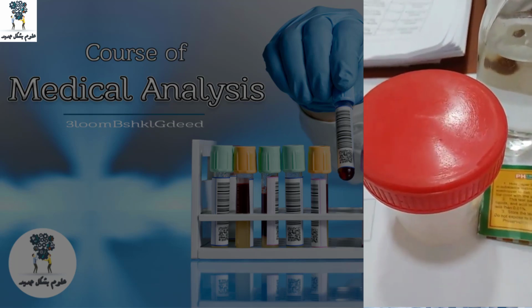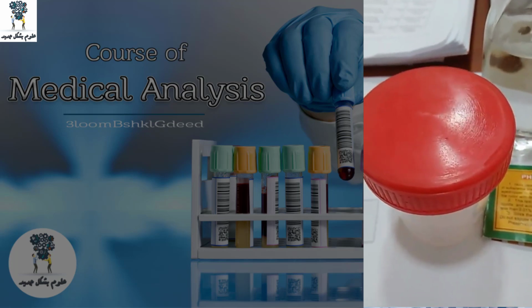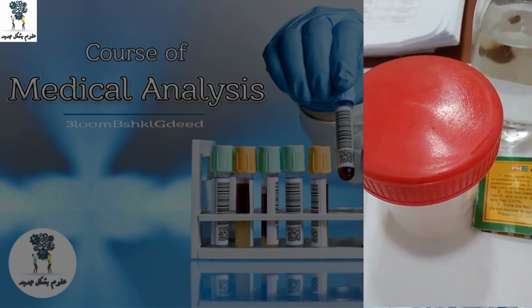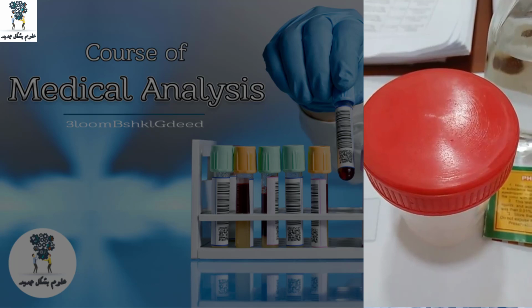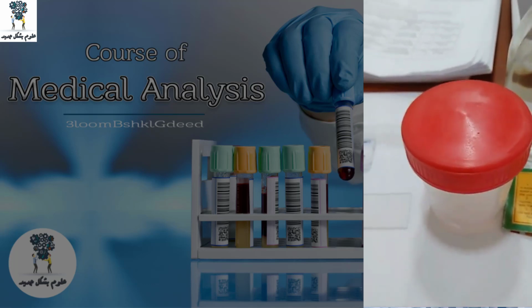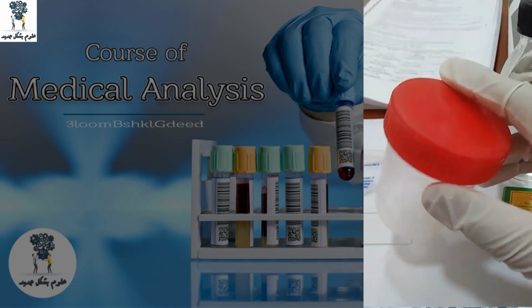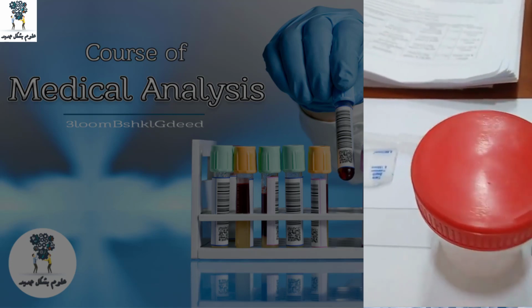So we will write a comment that sperm count wasn't susceptible to accurate measurement due to incomplete liquefaction. Actually, here there is no incomplete liquefaction. In this sample, it is normal, and we can measure it.